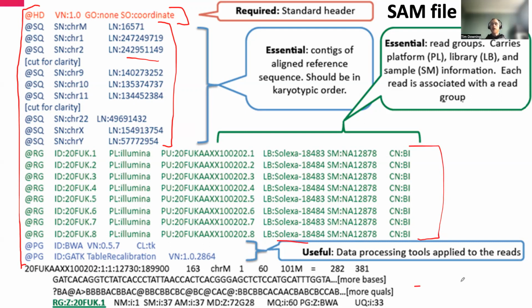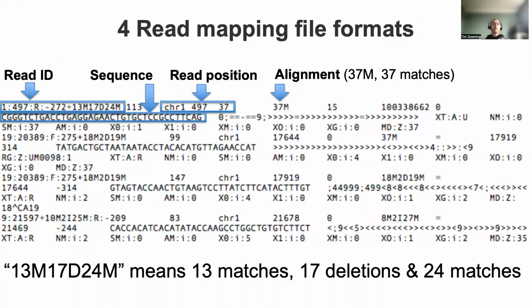Further down are the actual mapped reads, contained over several lines, as you can see. Each contains an ID tag, the sequence information, and then the read quality information. So we can look further at what's inside each read. You have the ID, and if you have paired reads, you want to match the partner together.